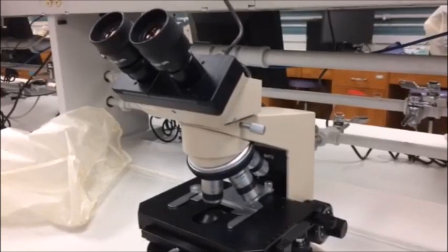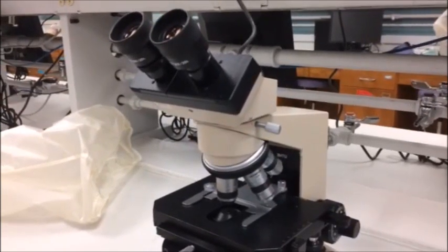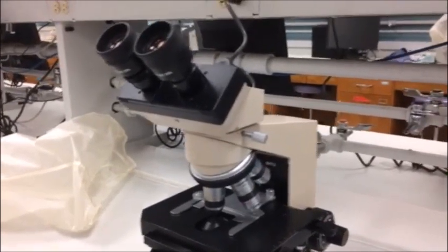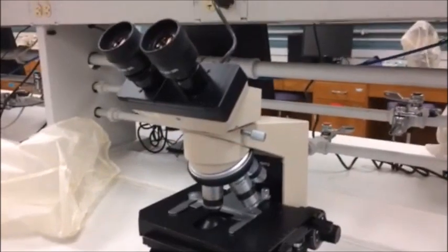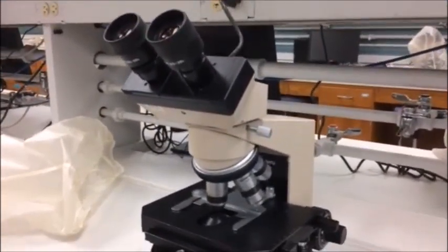So it's really important that you go through all of the steps on the setup of the microscope that are listed on the web page on Brightspace. Before you do that though, let's take a look and just familiarize ourselves with some different things.